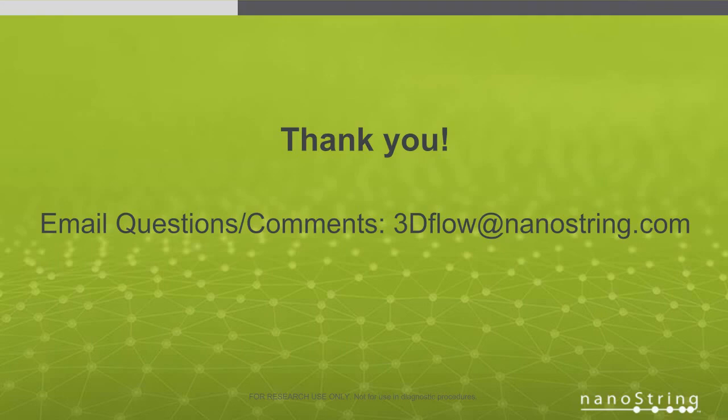A little bit. Yeah, I was just going to say that one of the strategies that's become really common, I think Karen mentioned this earlier, is doing a negative selection prior to staining so that you can reduce the flow time, the amount of time on the sorter. So that's one piece. But from start to finish, it is 2 days.